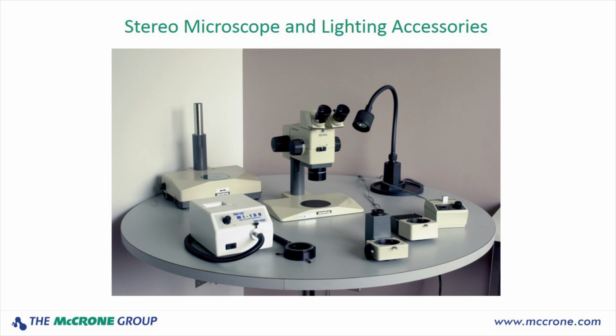And this ring light attaches to the base of the objective lens to provide nice circular lighting around the sample. We also have to have some sort of a module to attach a camera to it now. Then we have what's known as coaxial illumination, where two parallel light beams come down to the surface of the sample and reflect back up through the objective lens. You also need oblique lighting, and for that I like to use the black gooseneck halogen lamp in the back here, and that really floods the entire field of view with a nice bright light.